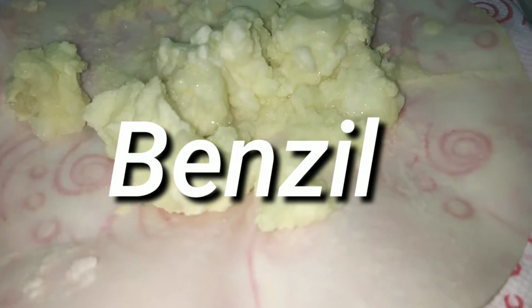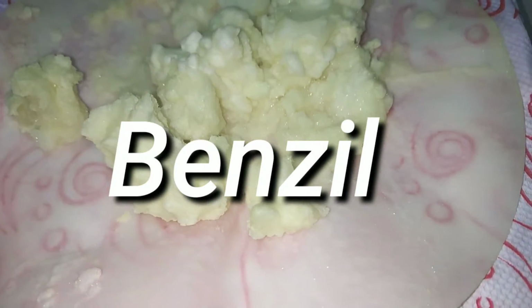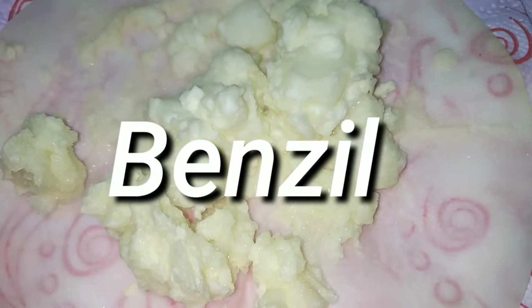Hello friends, in this video we synthesize Benzil by the oxidation of benzoin.